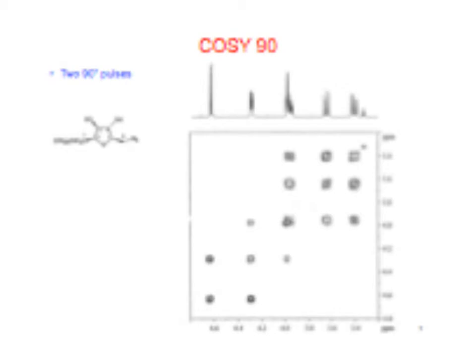Okay, so let's just take a look at this one. Here's the molecule on the left. What we would like to do is to try to assign which peaks are which. Notice that they've printed the spectrum here, but we could take this same spectrum and tip it over here and print it along this axis as well.